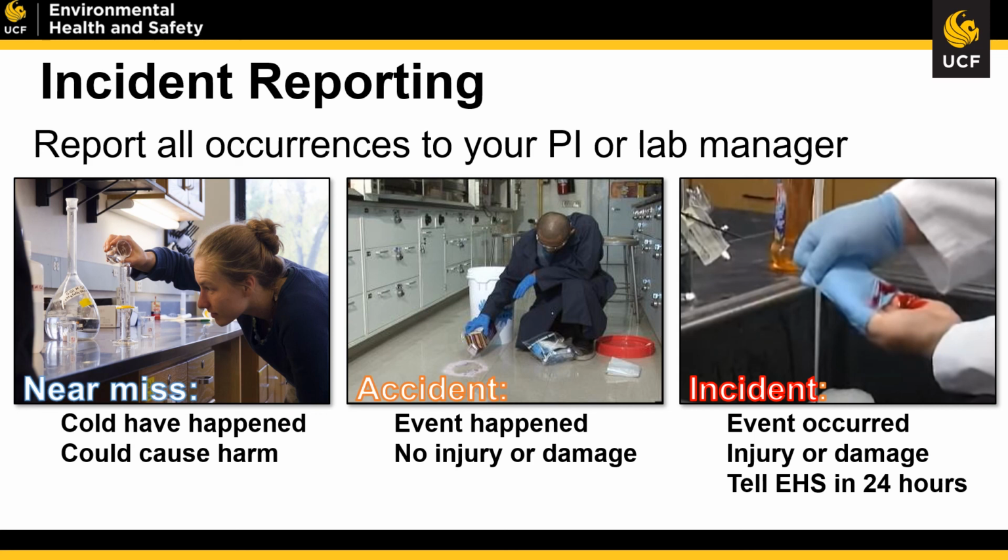Now, if something did happen, and say I dropped that bottle, it broke, there's a major spill, the building's on fire, I significantly got hurt, that's an incident. And an incident does need to get reported not only to your primary investigator, but also to the Environmental Health and Safety Department within 24 hours of it occurring.